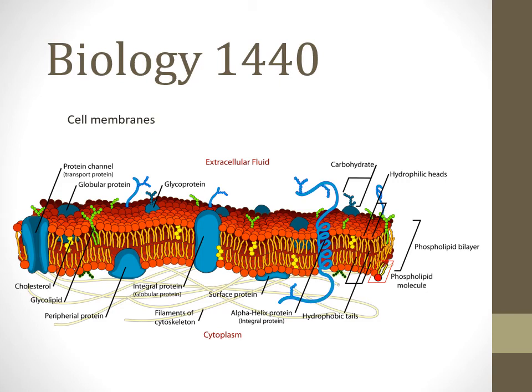Welcome to Biology 1440. This is the first pre-lab video for the first in-person lab of the semester. That lab will be over lab 2 of the manual. And the purpose of this lab, well, there's several purposes, but we're going to learn some experimental design, hypothesis writing, and how to make a standard curve.